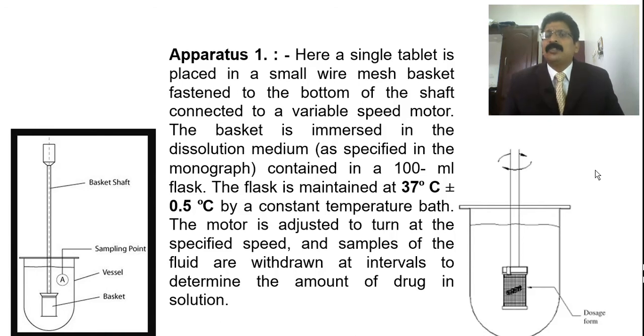Previously also we have done this, but many automatic machines now automatically take samples. Once you take 1 ml or 2 ml or 0.5 ml or 0.1 ml from the flask, it is necessary for you to replace that particular solution. Also, if you are taking the gastric fluid, it should be replaced by gastric fluid in the same beaker. Then only, when you take the next sample, the dilution calculation will be done by the pharmacist to give the concentration released in 30 minutes.